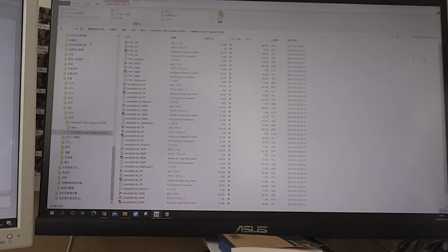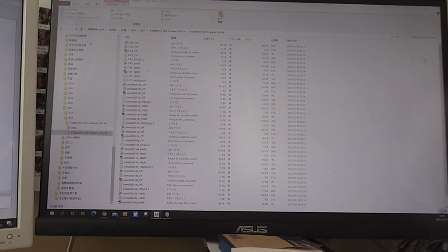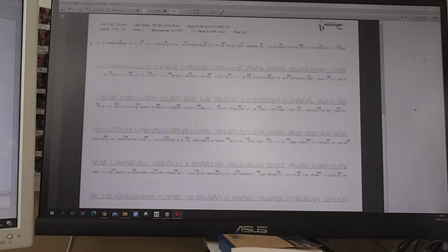Yeah, so after extraction of DNA, for example, in that case from a bacterial isolate in a laboratory, we can get the sequence data like this. Could you please see this one? This is just raw data about sequences. In that case, to identify the bacteria we focused on the 16S rDNA, and after PCR, we try to get the sequence data from PCR products.